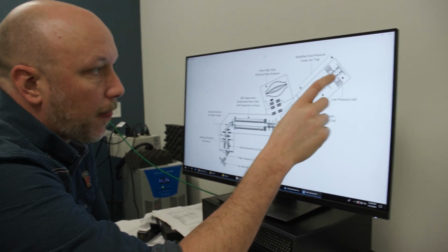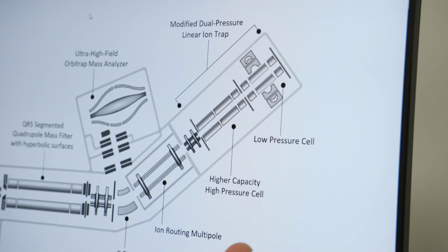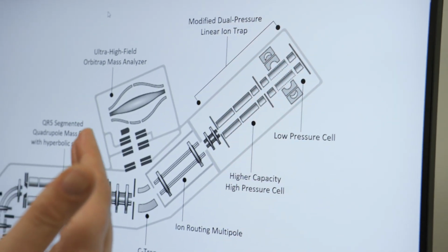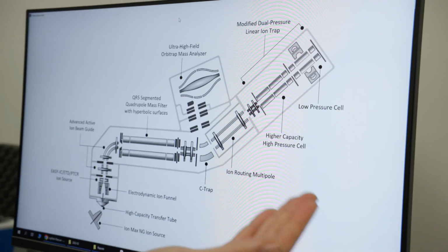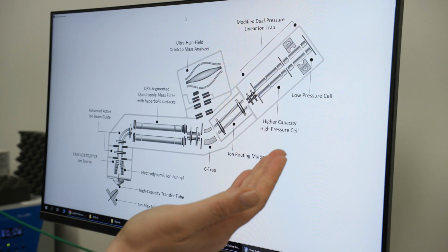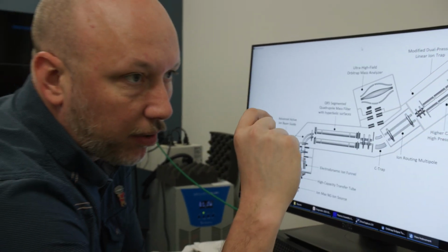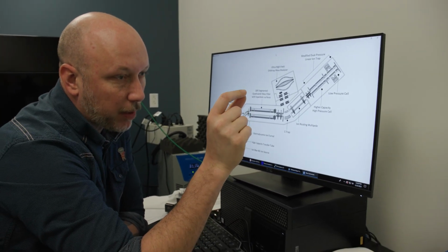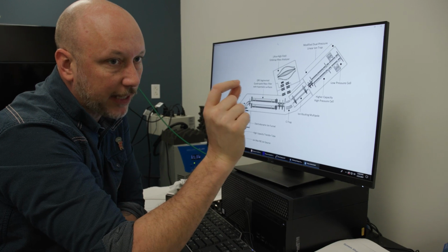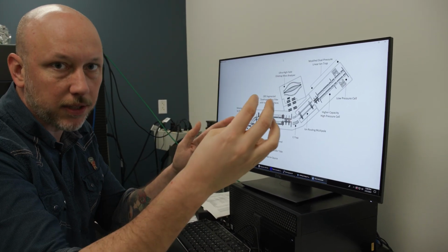So what this ion trap allows us to do is a reaction called electron transfer dissociation. So instead of colliding our glycopeptide into a gas molecule, we have it react with a very specific negatively charged radical anion, and the electron is tunneled to the glycopeptide, which then does a chemical rearrangement in the gas phase, so we can break apart and sequence our peptide without losing the glycosylation.